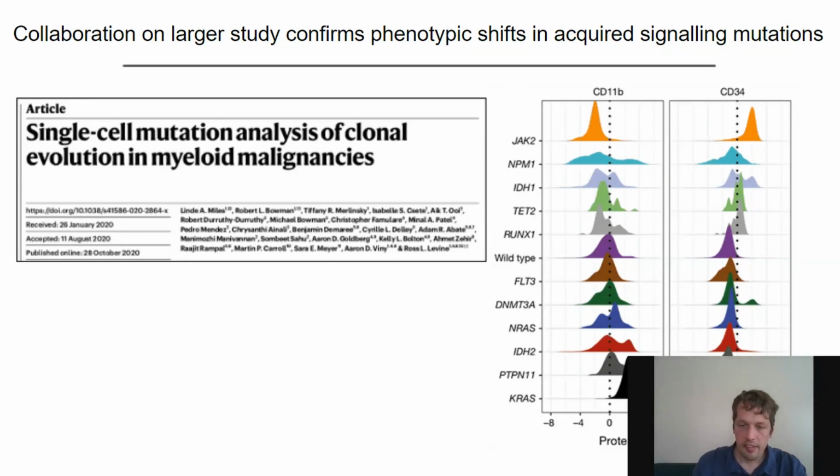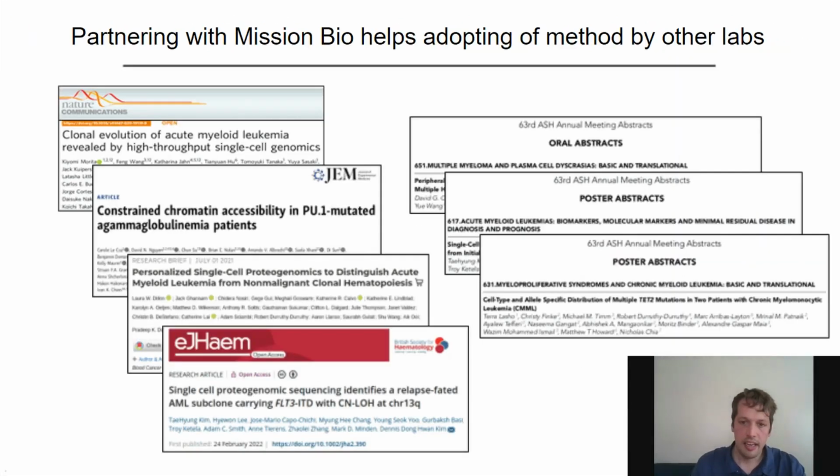Now, a particular design decision we made in the development of this method was that we basically built it on top of this commercial microfluidic system from Mission Bio, in order to enable non-expert groups, non-microfluidic expert groups, to use the technology for their own questions. And it's really satisfying to me as an engineer to see that many publications came out over the last year that already picked it up and applied it to their research questions.